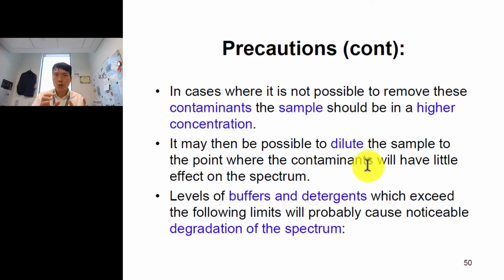If it's not possible to remove these contaminants using this TFA in water, using the salt dialysis, then you should prepare a sample at high concentration. Then you can also dilute the sample until the contaminants, which should be at a lower concentration than your sample, have lesser effect on the spectrum. So either you dilute such that your contaminant becomes so little that it doesn't affect it, or you can remove it. The level of buffers and detergents, but take note, not SDS, which exceed the volume limit will probably cause the spectrum to degrade.